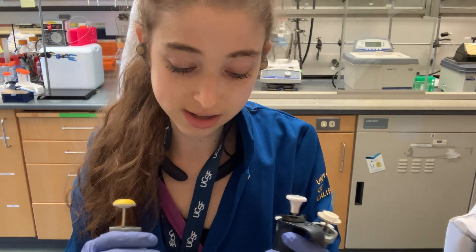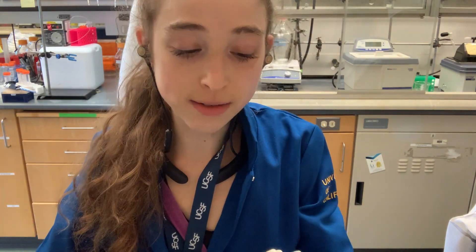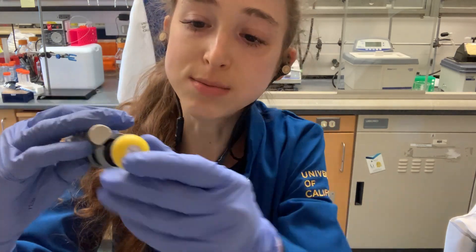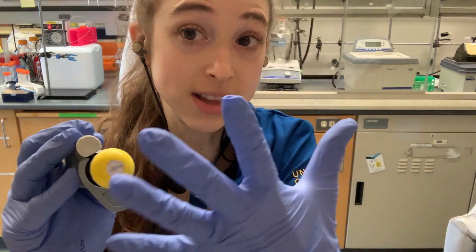What it means for you is that your pipetting is going to be most accurate if you choose the pipette that has the lowest volume. So to pipette one microliter, I would want to choose the two microliter micropipette. If I don't have one, then the P10 would be better than the P20. Actually, I can't even use the P20 for this because its range is two to 20 microliters, and it's only going to be accurate in that range. Don't go below or above the range — that's going to hurt your pipette. Be nice to your pipette and it'll be nice to you.